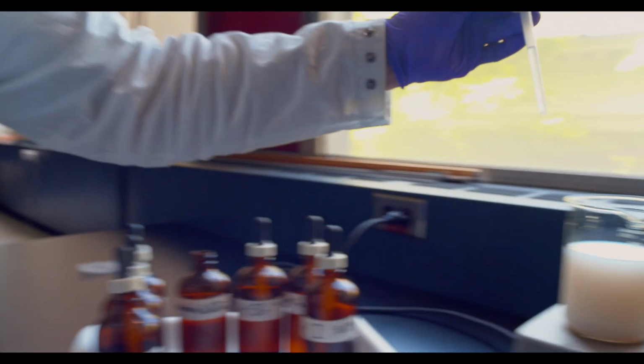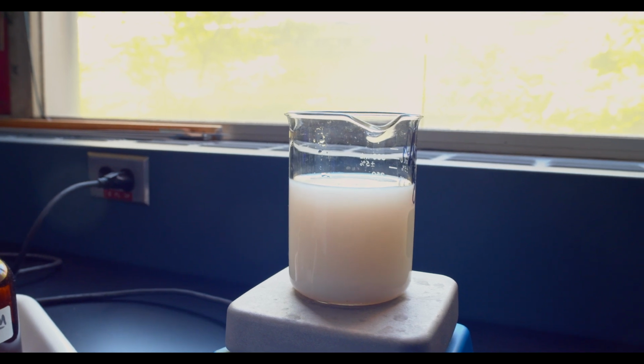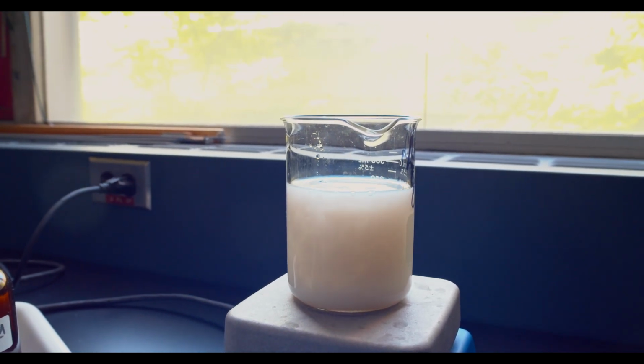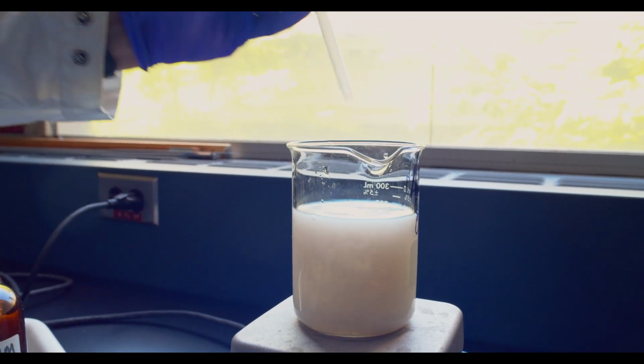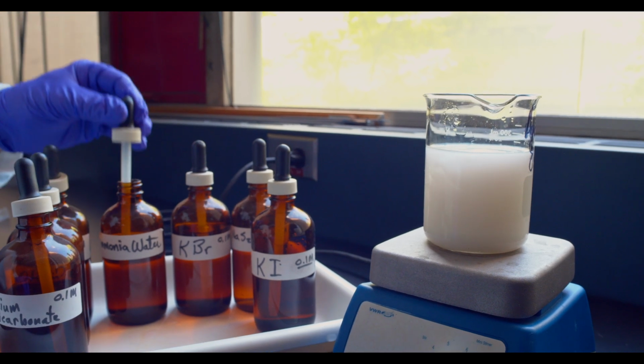Next, we're going to add ammonia water, and this should form a complex of the silver that is soluble. You can see as I add, it actually takes quite a bit.